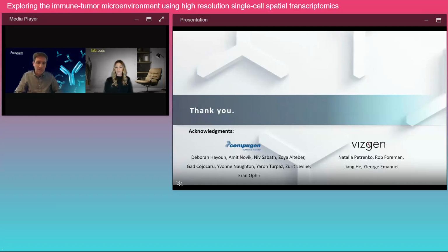Of course, it depends also on the size of the panel. Right now, we use a panel of 350 genes. So the larger the panel, I suppose you will have more transcripts in the cell. And it really differs on the cell types. Some cells that are more secretory might have more transcripts because they need to manufacture some protein, while others will have lower levels. But basically, we can see something, and this is part of quality control, we see several dozens of transcripts per cell.